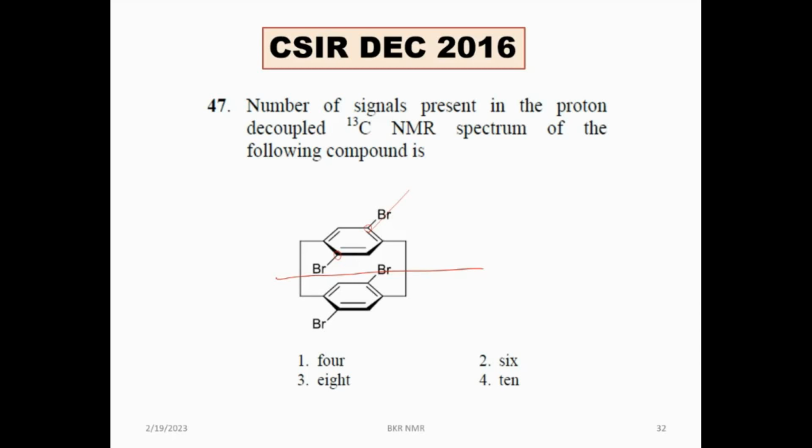So this is a highly symmetrical kind of molecule. Therefore, these four carbons are the same. The 2 benzene rings are the same. Now let's follow what the different types of carbon are. So this and these are the same. So one, if I suppose. Now this and this will be the same. You can see the junction between bridgehead and this.